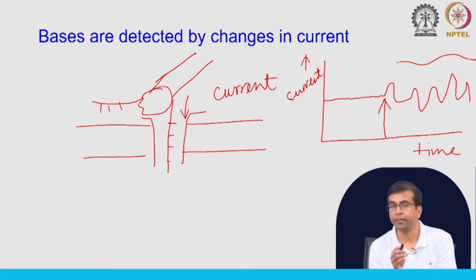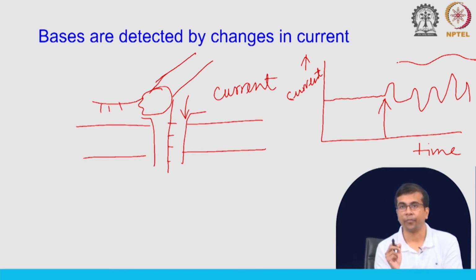Okay. And there is a specific characteristic of this specific set of sequences that will induce certain changes in the current. Okay. Now, as you can probably imagine, this is quite a difficult process, right. So, identifying which bases are passing through the nanopore from the current signal.